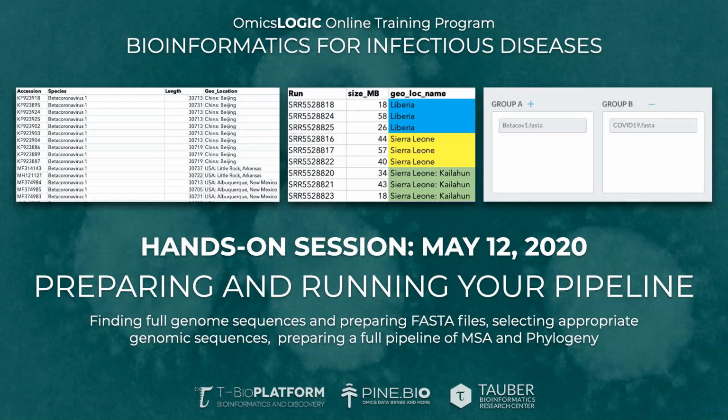So Beecha, if you could post the link to the SF9 project, that has a very detailed step-by-step explanation of what to do with the first pipeline. And I really was looking to see that some of you would be able to go through that project to really make sure that you understand that step-by-step sequence.